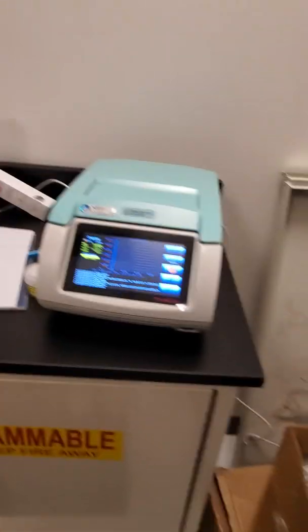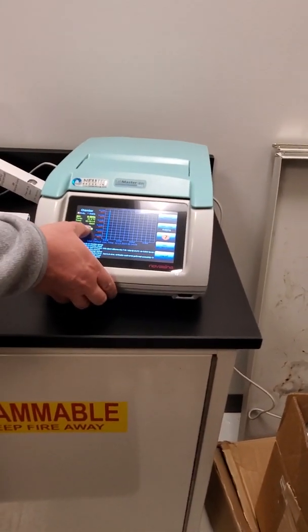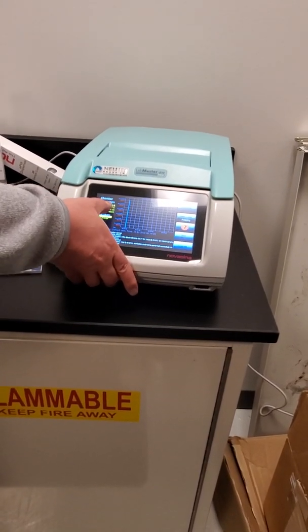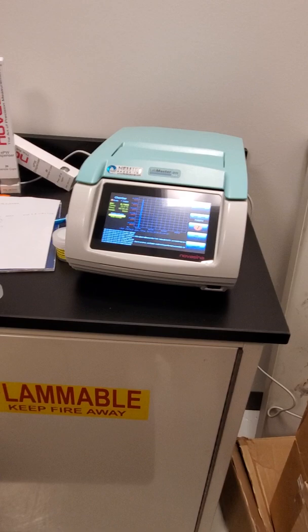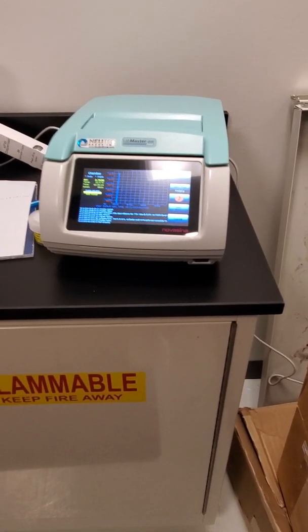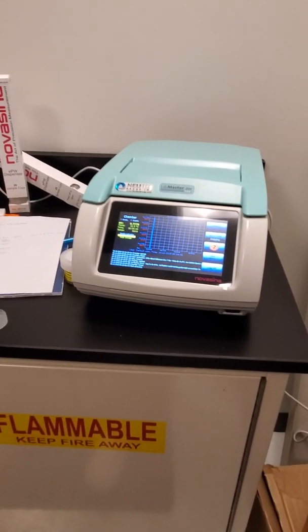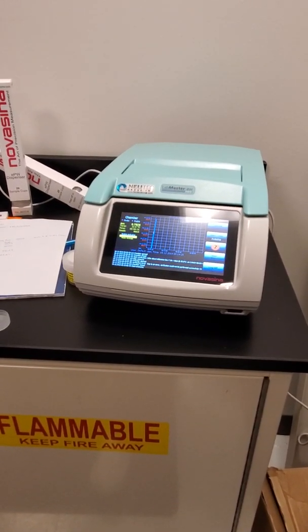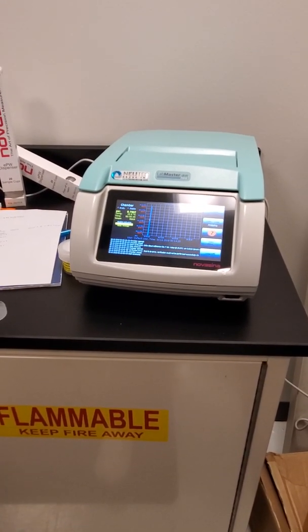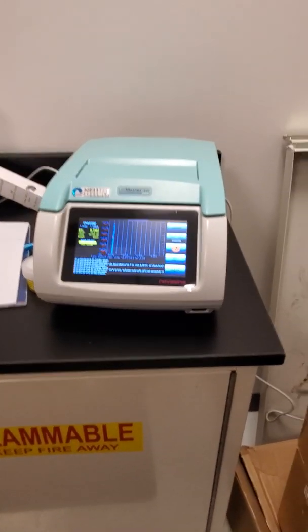But even if you aren't here, you come back, it'll show the reading that it got based on the stability setting down here, and then this one will still be updating in real time. So if you ran a test and went away for 50 minutes and came back, you're going to get your value off the stable indicator, but you'll also be able to see immediately whether or not that was true vapor equilibrium. And so that's valid data.